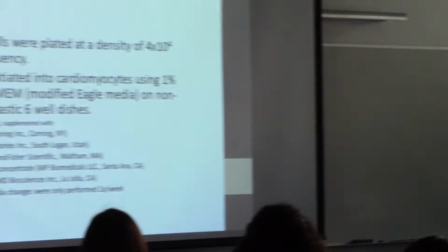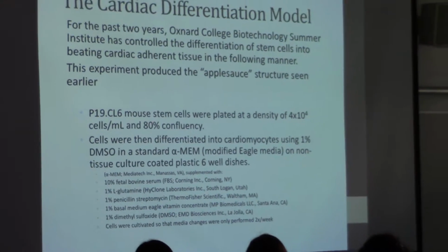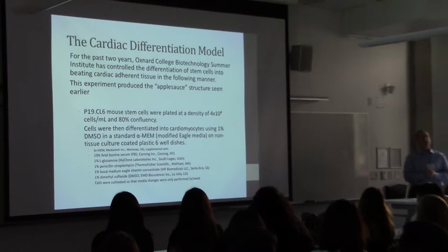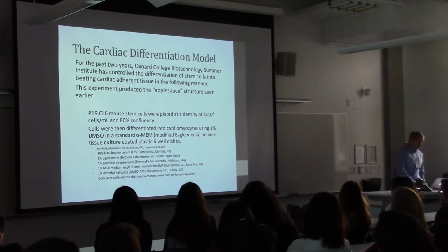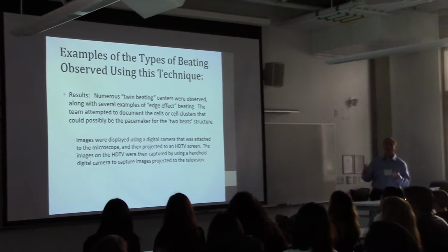Due to the time constraints we have in our lab, we only are able to get in there really 2 days a week. We don't have a lot of resources. And we're working on that. But we only change the media twice a week, so that's worth noting. So I'm going to show some different types of beating that we get using this technique.